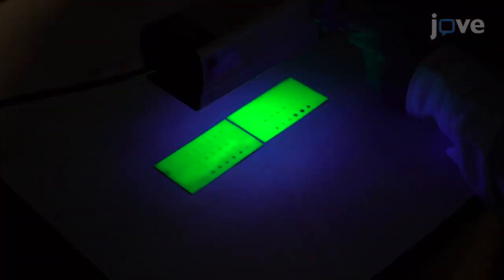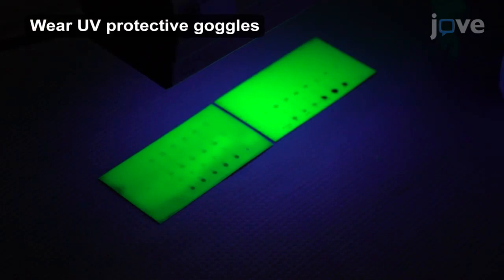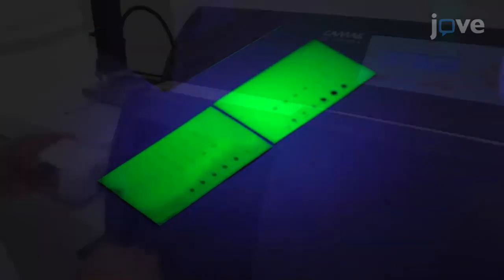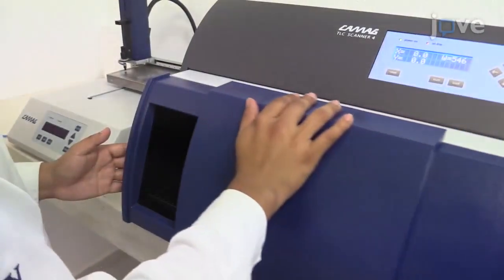Visualize the caffeine bands in short wavelength ultraviolet with a compact UV lamp. After this, quantify caffeine levels by densitometry at 273 nanometers.